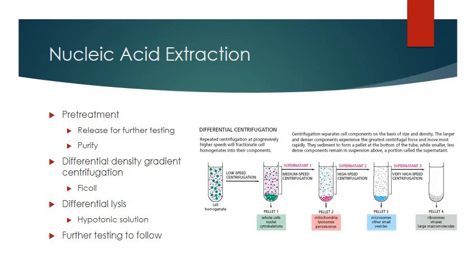And the next, then when we're talking about nucleic acid extraction, remember that our primary purpose is to release the nucleic acid from the cell, whatever our target is, so that we can use it for the next step.